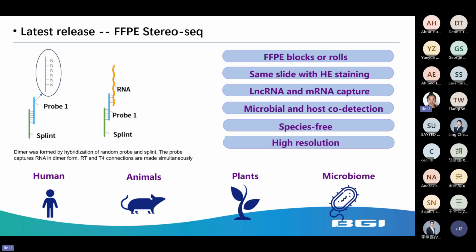As I said, because the probes are random, it can capture long non-coding RNA and mRNA information at the same time. It's also species free, so it can also capture the information of microbiome and host codetection, and it also remains the high resolution of its features.